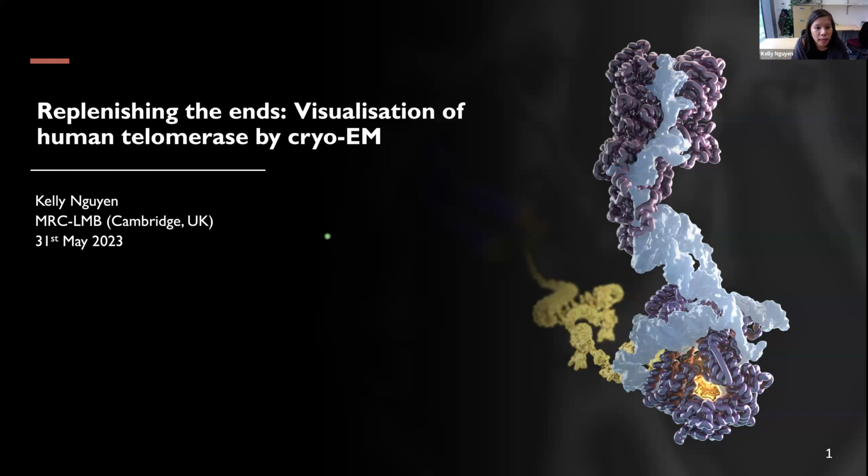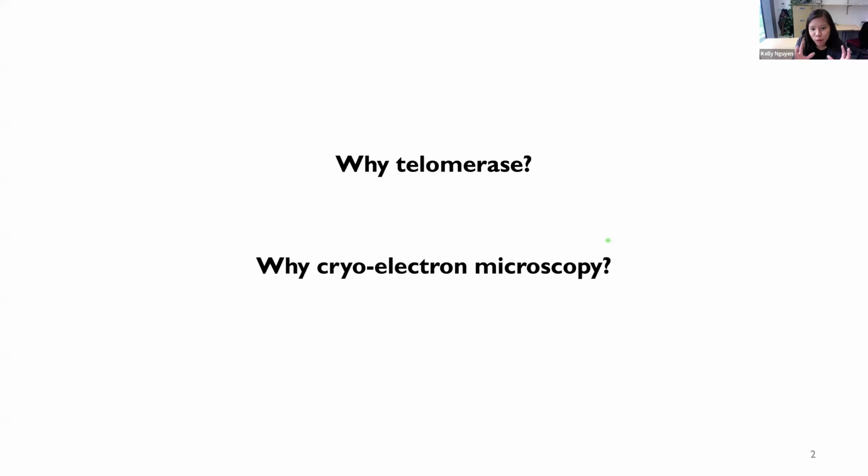So what I'm going to tell you today is how we're using this technique called EM to visualize this molecule that Liz has mentioned called telomerase. The main goal of my talk today is to get across two main points. One is why we study telomerase and why it's important, and the other is why CryoEM was very instrumental in our understanding of this molecule. To begin with, I'm going to give you an overview of why we study telomerase first.